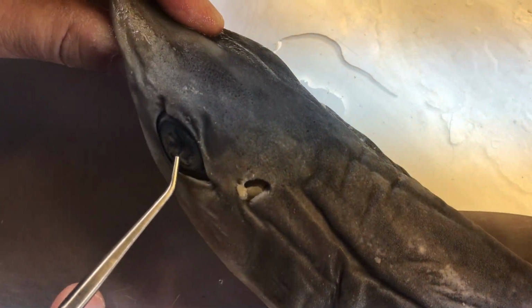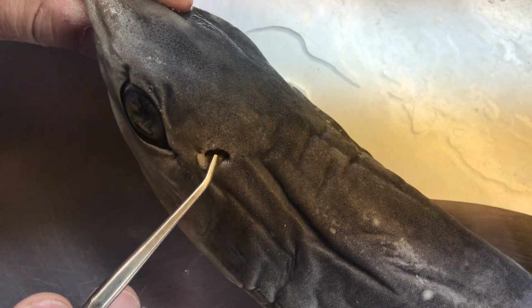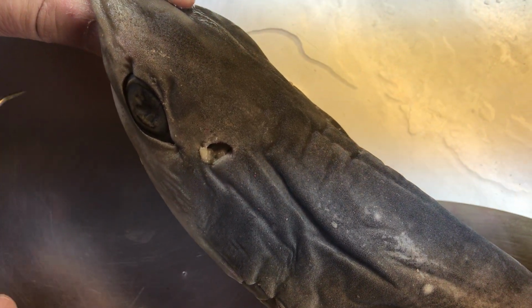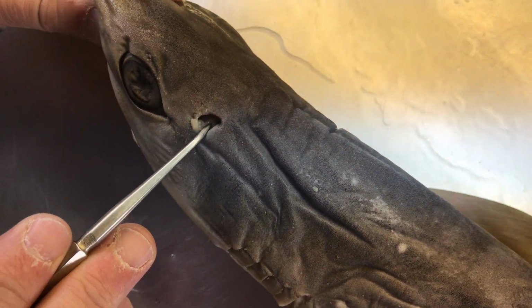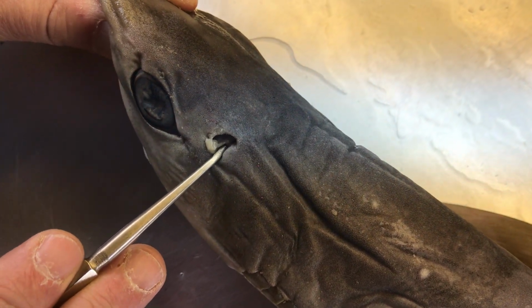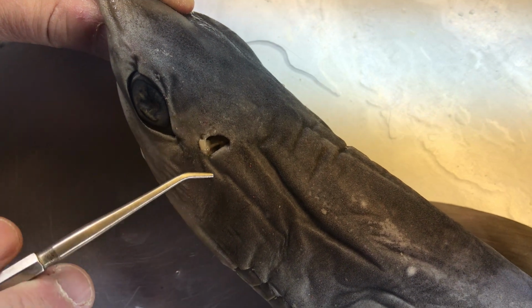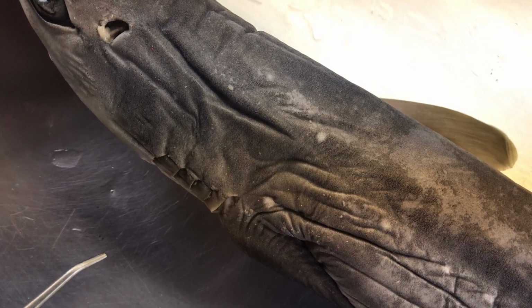We also have a pair of eyes. These are the photoreceptors. We have a pair of spiracles. These are actually for incurrent water to come in if the mouth is full and water can't get in over the gills. Water can still enter through the spiracles. There's one on each side of the head. Inside of here, we have gill tissue that is called pseudobranch. So when the shark's mouth is full, water can still go in through the spiracles here, and then over the gills, which are internal, and out the external gill slits.